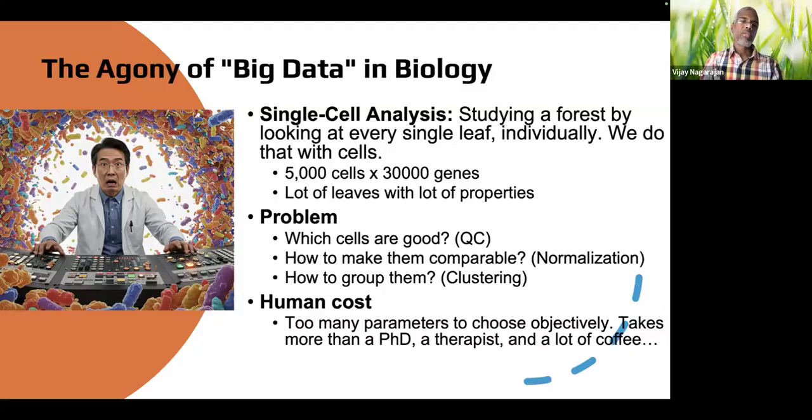Or sometimes folks go review the literature or the relevant papers in the relevant domain of study, and then they identify like 6 or 7 or whatever. The other routine way to figure out the QC is to look at the data itself. Generate the summary plots, look at the distribution across different samples, and then visually look at the tail and figure out where you want to cut off the tail, the outliers. That's another approach. So this is all we've been doing all this time.